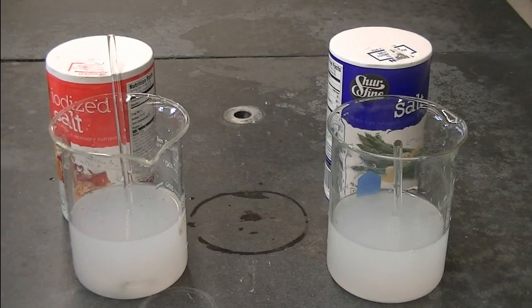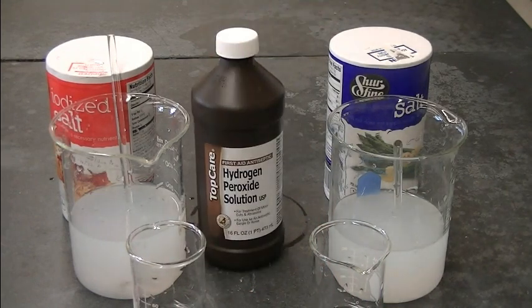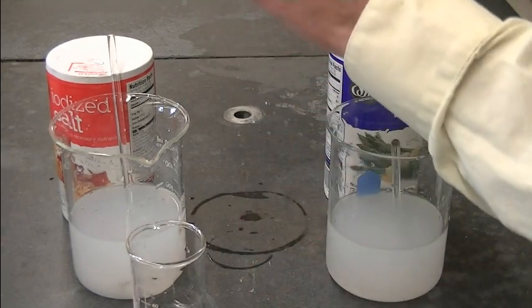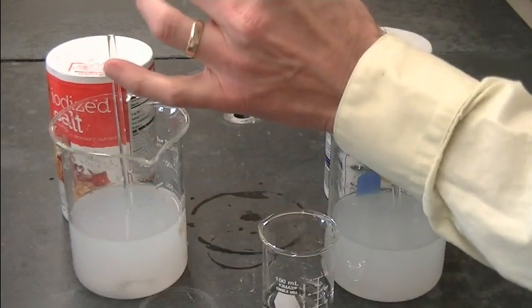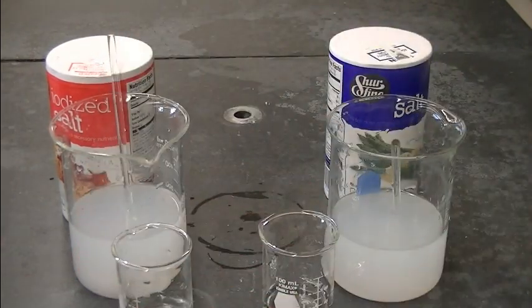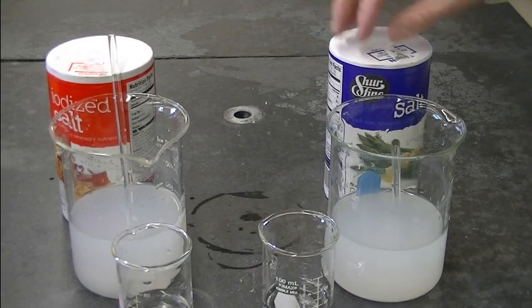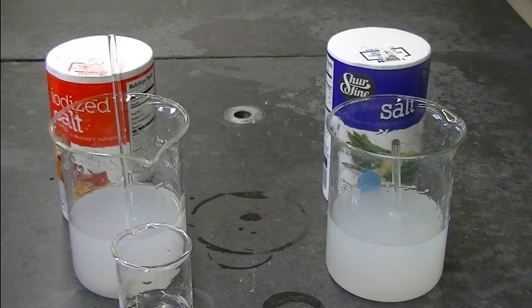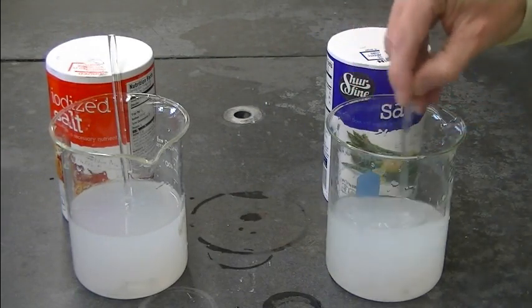Now we're going to add the reactant that will test for the presence of iodide: hydrogen peroxide. I'm going to add about 20 mL each — around a tablespoon give or take. The hydrogen peroxide should react with any iodide ion present in either of these two salts to form iodine.